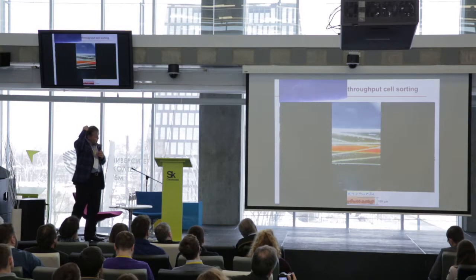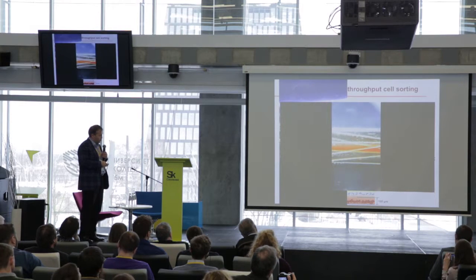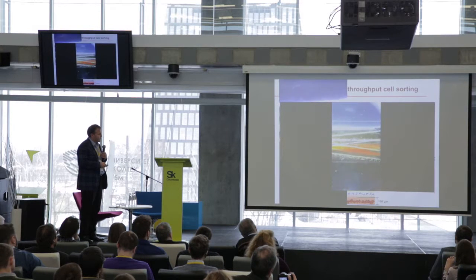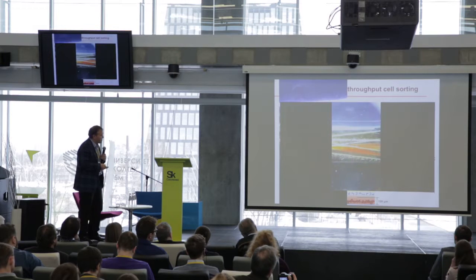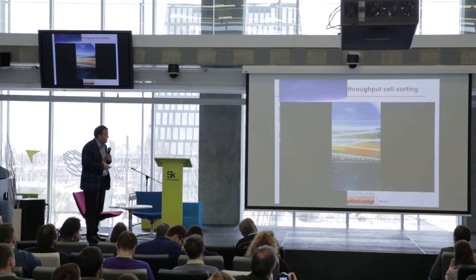So what we have been doing now is moving this to cancer blood. These are healthy patient blood samples, spiked with cancer cell lines first, and you're looking at the inlet of the system. The blood is flowing at 10 microliters per minute, 10 times diluted. You see all the red cells here, and a mixture of red and white cells in the second. And since it's not dark, you have to be careful. You see these small cells that are going into the upper chamber. There is another one that's going there.